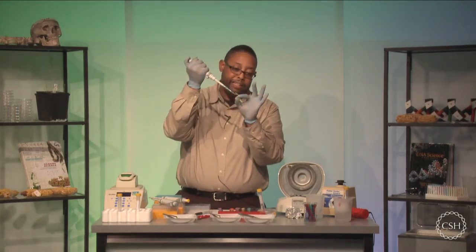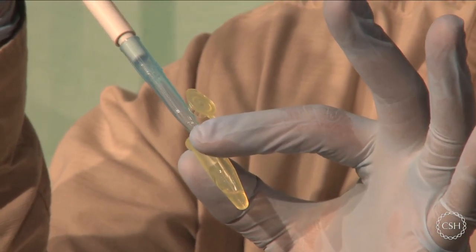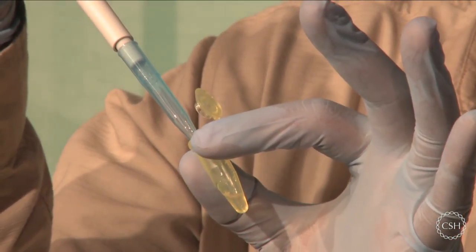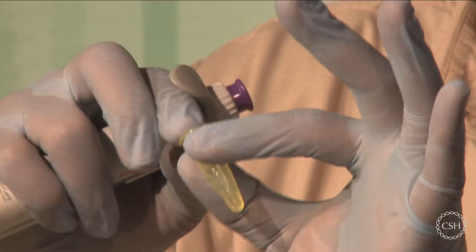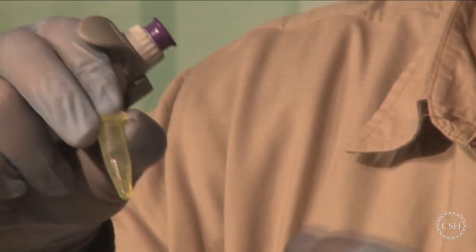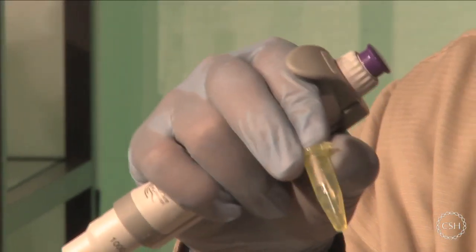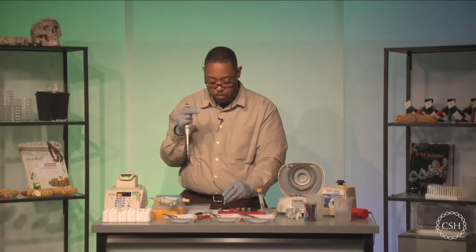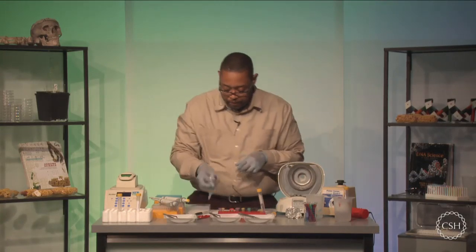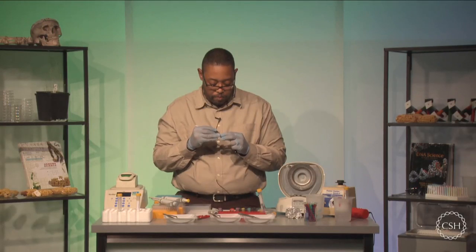So what I'm going to do here is not touch the inside of the test tube with my tip. I'm just going to release the contents of my tip into the test tube, and then work my way out of there. So what I did is I minimized the exposure of the material that was on the outside of my tip to my test tube and only delivered the clear lysate, or the liquid. Let me get rid of this. And of course, I've got to label my sample. This is going to be S2.